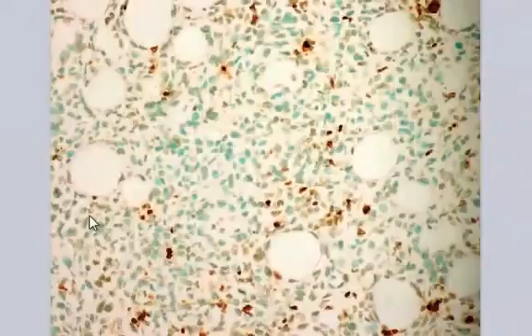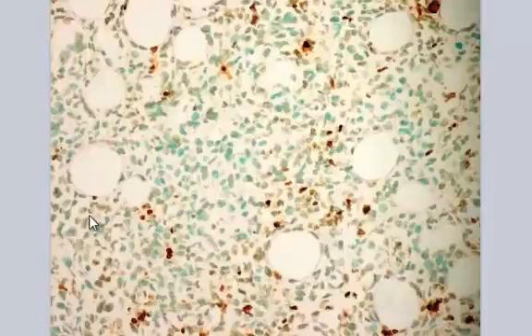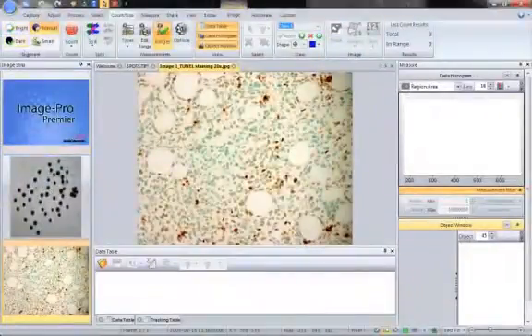Now in this case what we have is relatively dark objects on a relatively bright background, but we now have two different types of objects. We have those blue objects and also those brown objects. We also have a problem with shading in the right hand side of the image. In this case, we can no longer select just bright or dark objects. The shading and the color will get in the way.